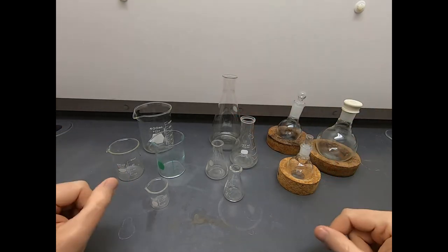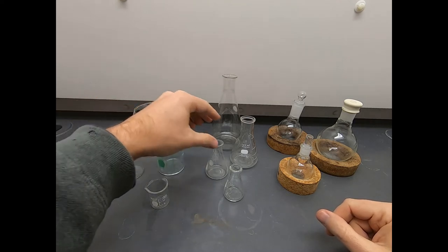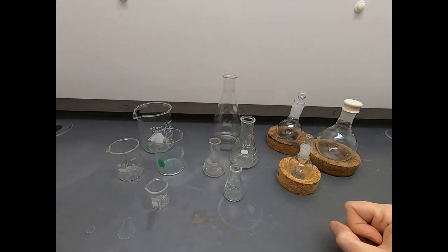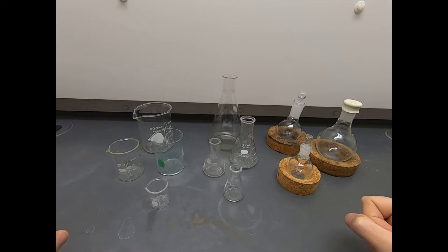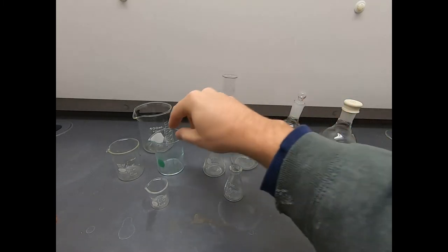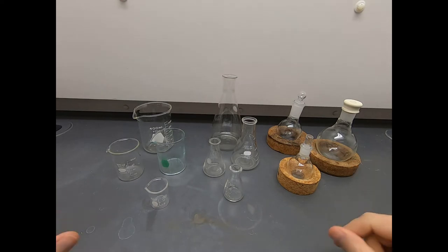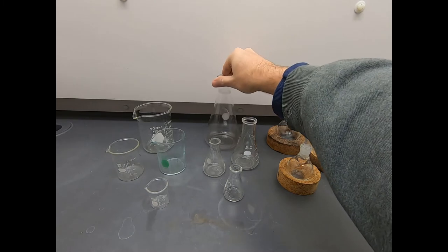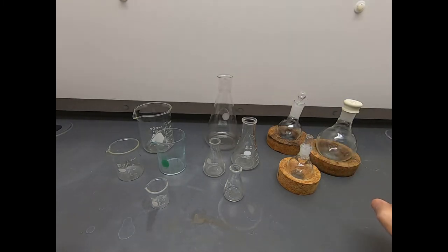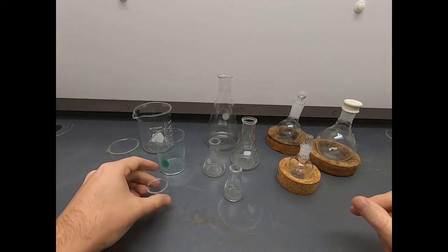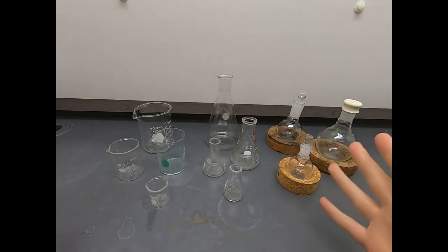For many times, if you want to make up a solution, beaker is great for that. Sometimes Erlenmeyer flasks are good for that too. And I'll be honest, sometimes which one I use is determined by what do I have clean on hand. If I have a clean 125 ml Erlenmeyer, I might use that over a 150 beaker. All these flasks and beakers come in different sizes. We have up to a 500 milliliter Erlenmeyer flask. These things come up to 2 liter and even bigger.